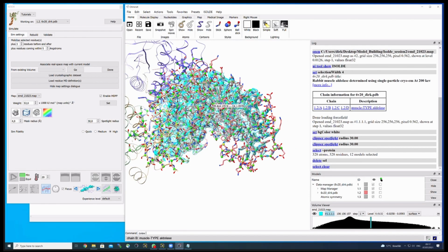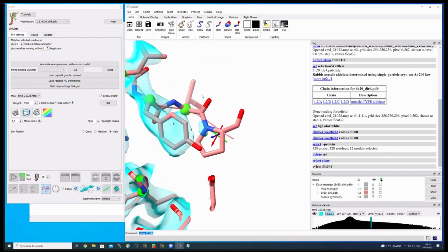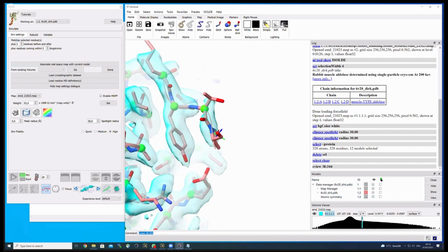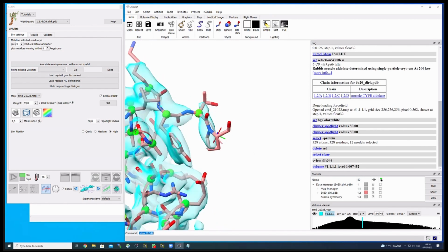For doing this, we would like to go to the C terminus of chain that is labeled with the letter B. And for this, we go to the very end, and if I'm not mistaken, this is 344. So it's center view, space /B, and then we have a double dot and 344 for the terminal residue, and here it is, a proline. So this is the very C terminus, not modeled correctly, but this is just a nasty detail because there is one oxygen missing if it would be the real C terminus, but it doesn't matter for now.